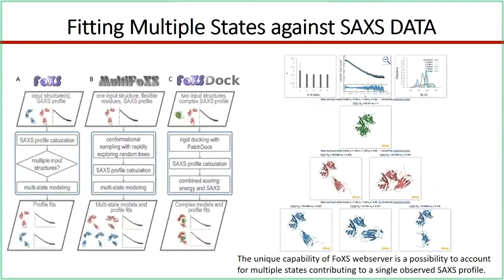That is very important because otherwise the random movement of the domains will give you something that is completely off. So that is one kind of contact information that you have to give.